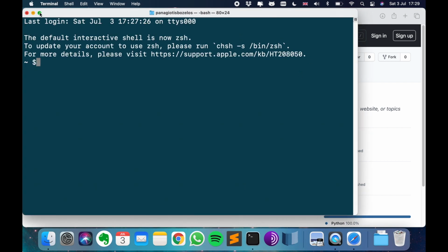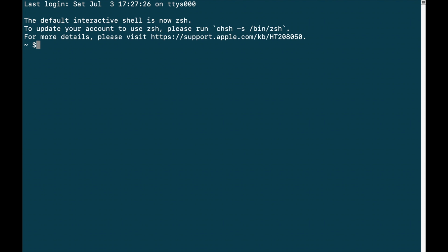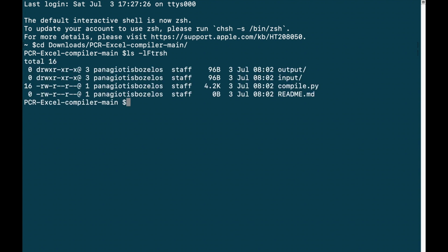Following that, open a shell, otherwise called terminal, on your machine and navigate to the corresponding unzipped directory by using the command cd. Once you do this, you can check out the contained files by making use of the ls command.